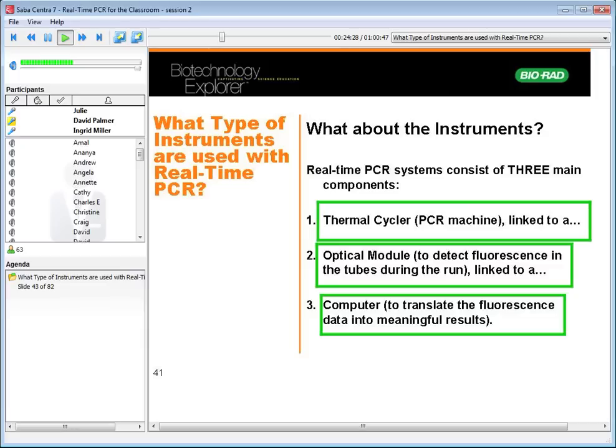Also, it's used in ecology and things like that, where you've got a population of organisms and you want to see how many different species you've got in that population, say a population of bacteria. How many different species are there? You can see right away by how many different curves you have. So that's high resolution melt.